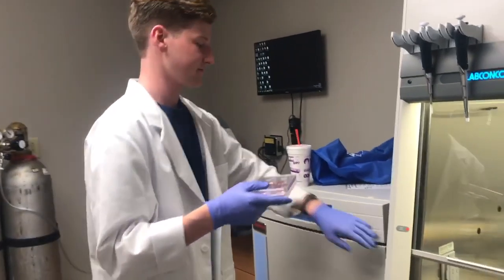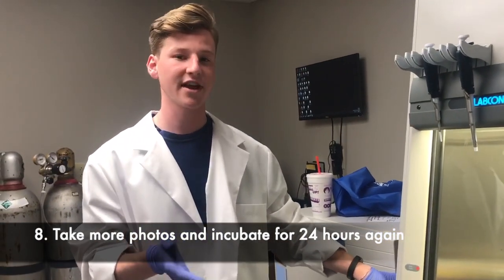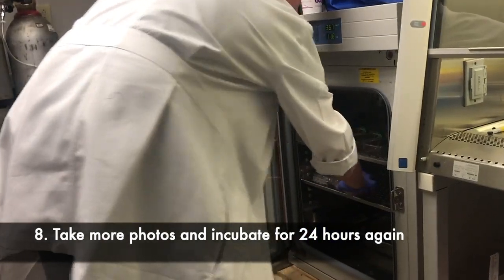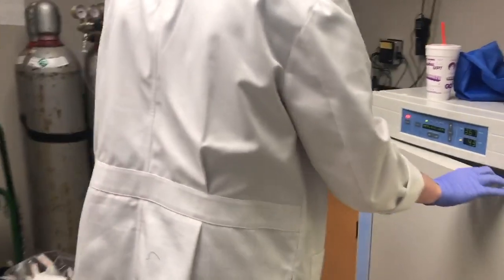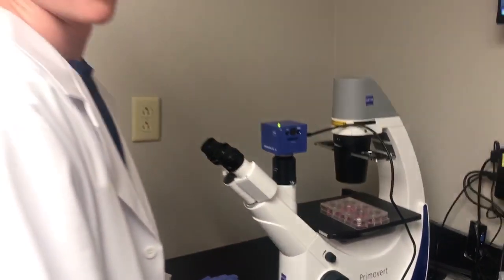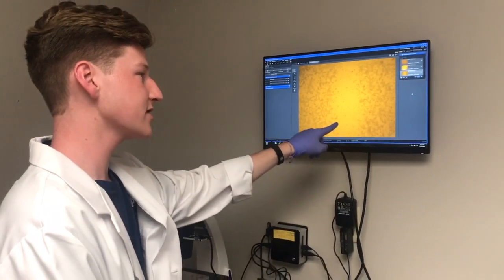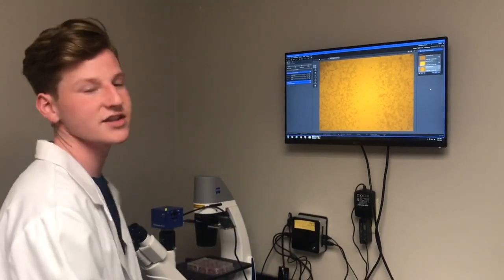It's now the next day, so we're going to go ahead and take our 24-hour pictures for the scratch assay. Take pictures at 24 hours and you'll notice that the cells have started to migrate back onto the scratch. Depending on what treatments you're using, every picture should look different.